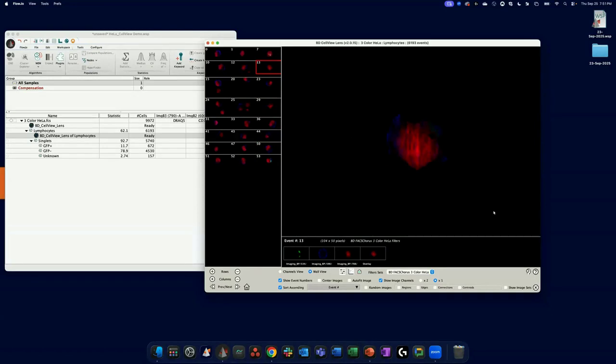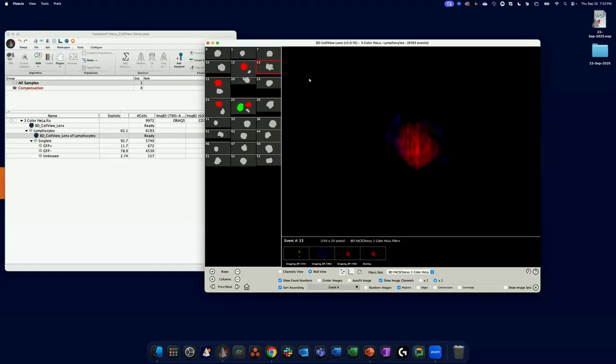Okay. We also have different values here to help you, more so if you're interested in identifying the center or edges of cells, particularly for cell-cell interactions. So if I turn on, for instance, regions, that converts this view almost as if showing how many different regions are detected in a single image. Right here, I can detect 3, here there's 1, here there's 2.